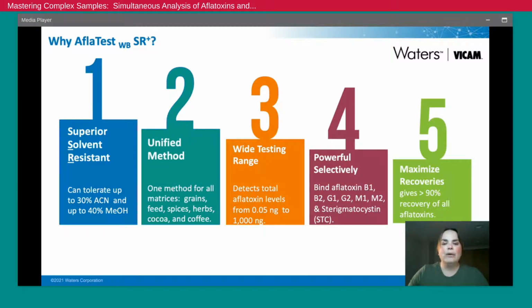We have discussed mycotoxins in detail and why we need to test for aflatoxins in our food supply. A variety of testing solutions exist for the determination of aflatoxins, ranging from easy-to-use rapid tests, which can be used at the point of production, to lab-based reference methods that are more time-consuming but can be used to provide a more comprehensive view of the level of contamination. Determination of aflatoxins is a challenging task due to the complexity of the matrix, often with high lipid content, the low concentrations in which these compounds are usually present, and the strict low regulatory limits.